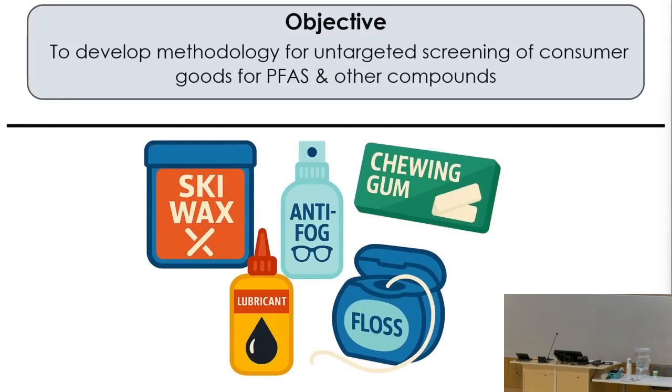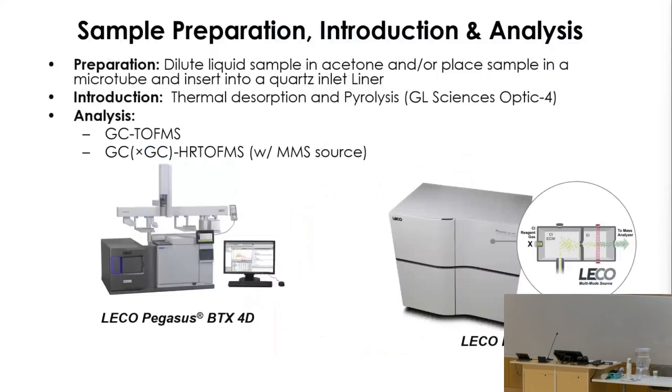The compounds that I've been looking at include ski wax, they include some special lubricants that we're looking at, dental floss, chewing gum, and of course, as I mentioned, anti-fog. The instruments that we used were the LECO Pegasus BTX to start off with, and then the high-resolution TOF.